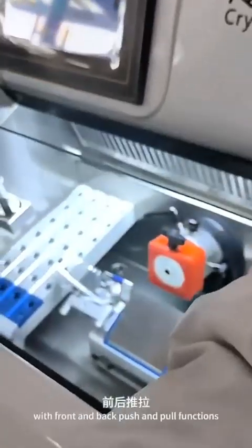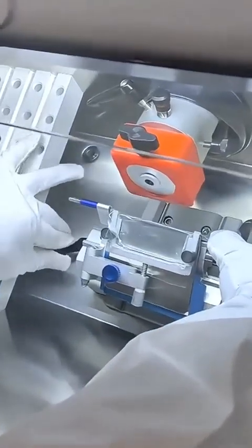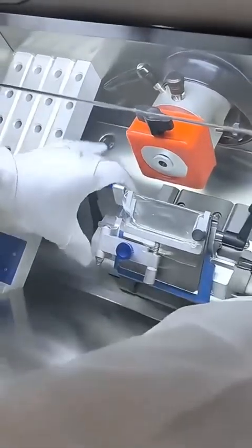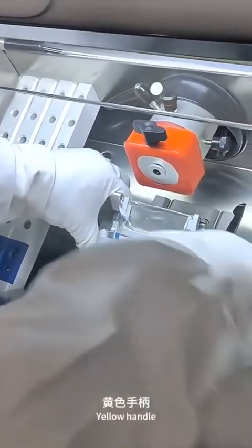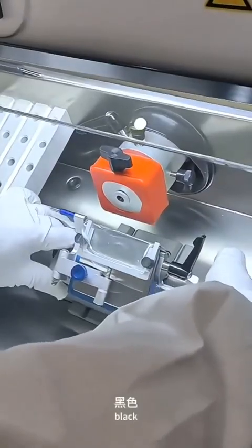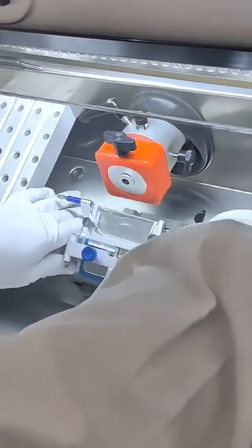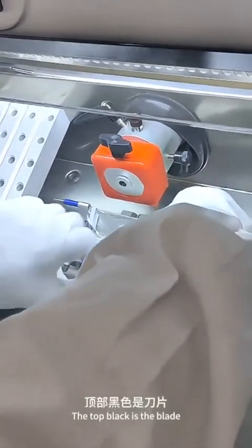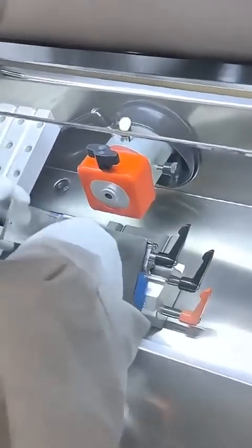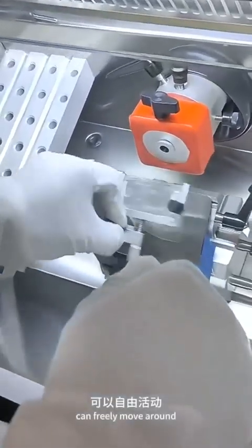This is a window with front and back push-and-pull functions. The left handle can be pushed back and forth after loosening. The yellow handle is for calibration, the side scale is black for left and right adjustment. The top black component is the blade, which is locked tightly. This is an anti-roll board that can freely move around.